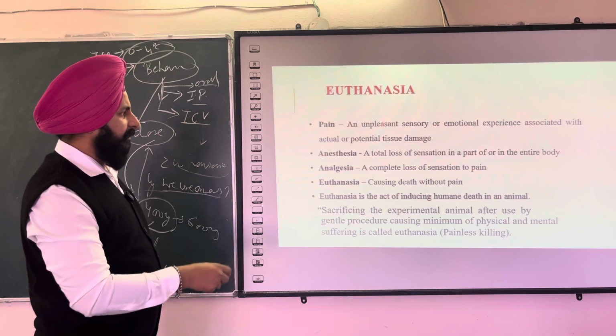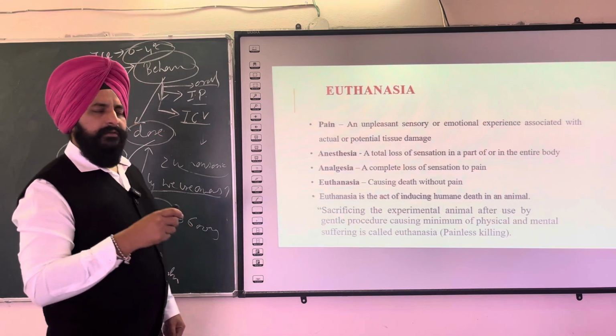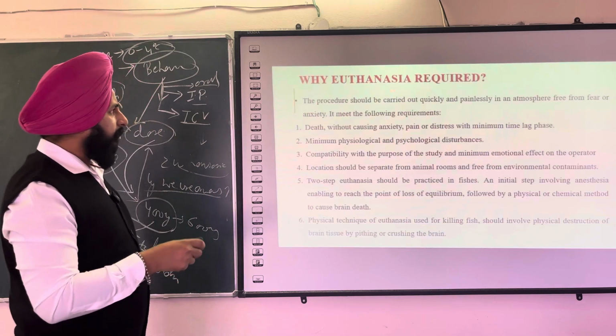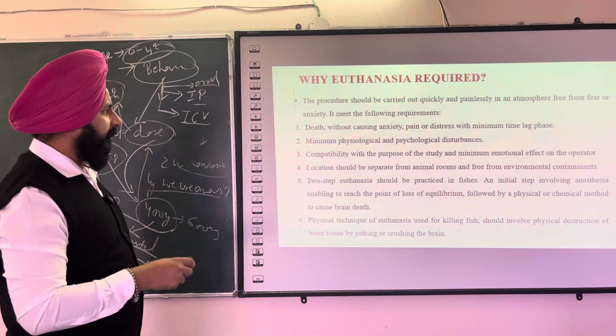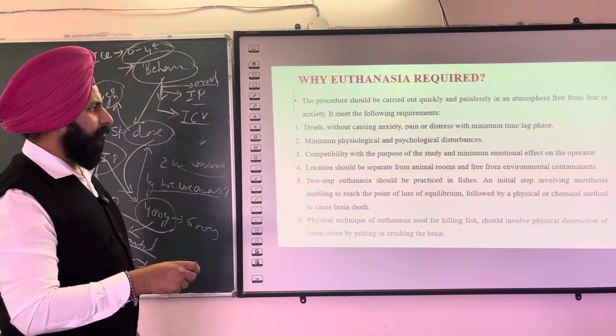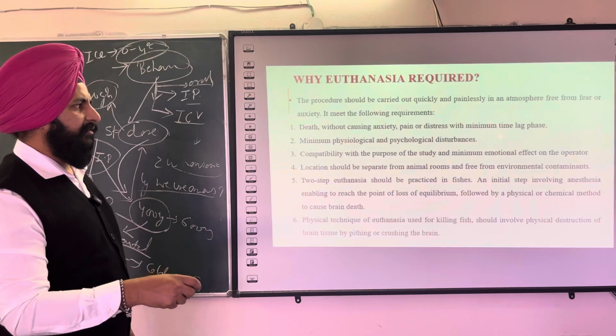These things are very important to note whenever you perform experimental work. So why is euthanasia required? Because it gives death without causing anxiety, with painless, minimum distress.